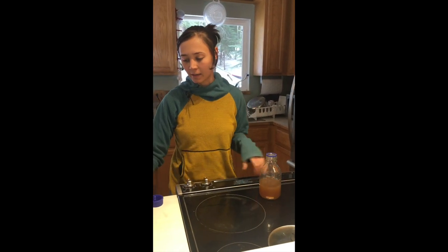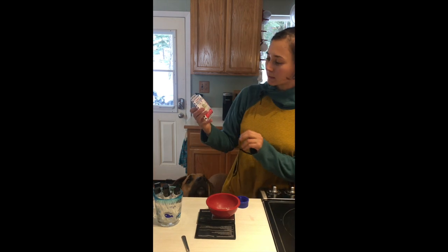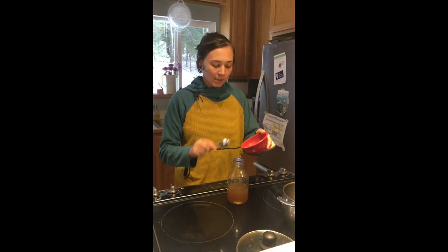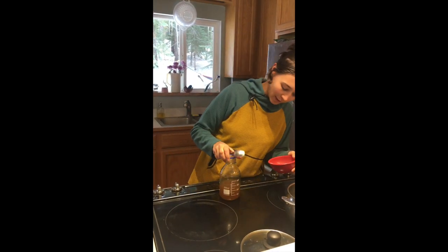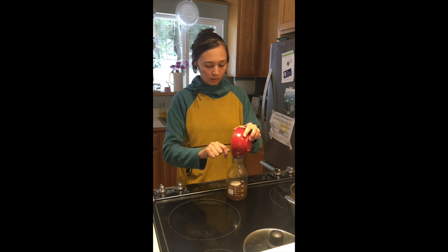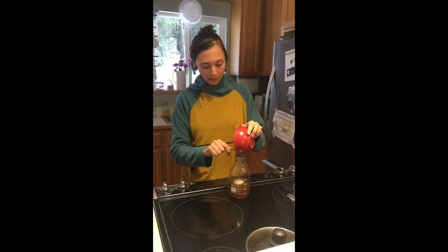I have my magnetic stir bar, so I'm gonna throw that in there. I weighed out five grams of agar powder — this is the Telephone brand. I've used different agar brands and it doesn't matter. Now I'm gonna add five grams to my media bottle with 250-plus milliliters of grain soaked water.